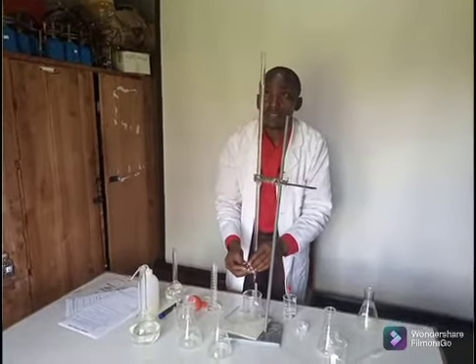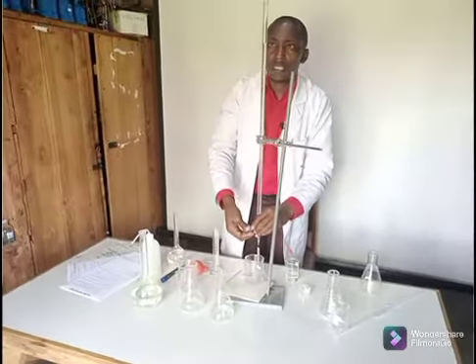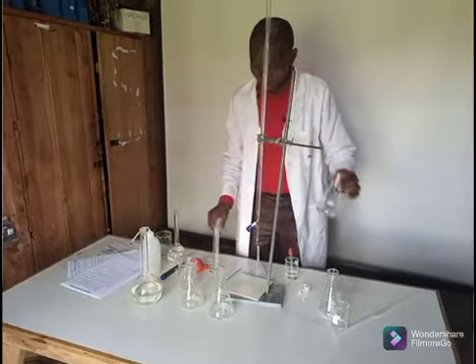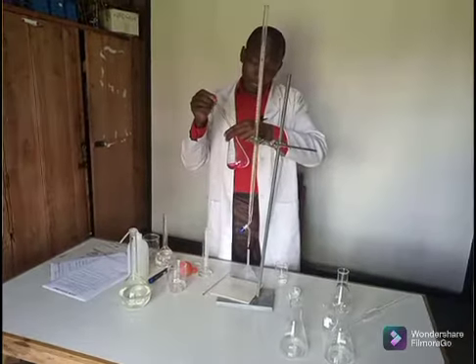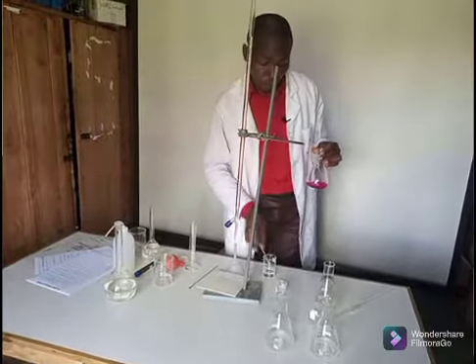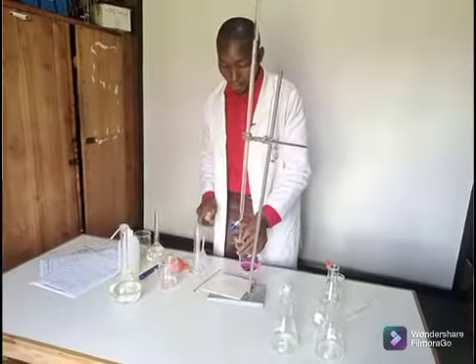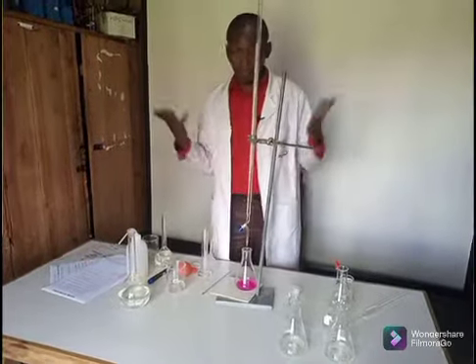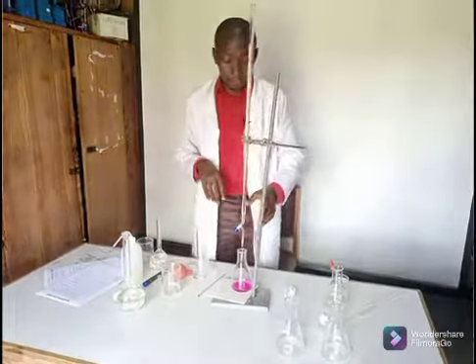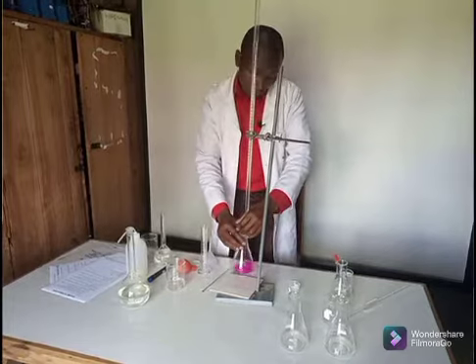So with this one, good. Again, I'm starting at the zero mark, and I'm going to do the final trial. I need to add 3 drops again of the phenolphthalein indicator, and I do the third trial. So the same, I know my volume. It's somewhere around 25.